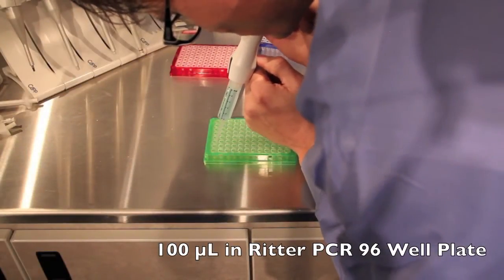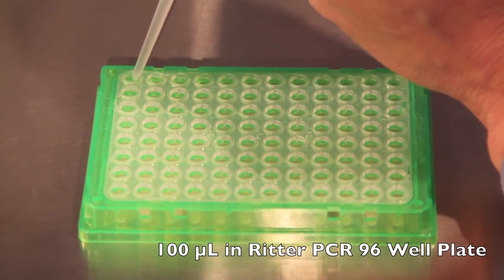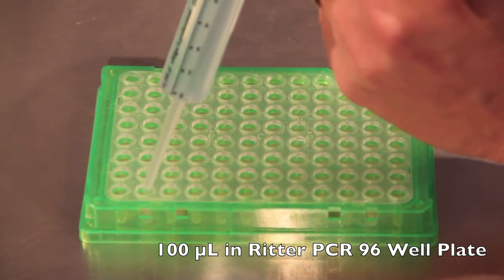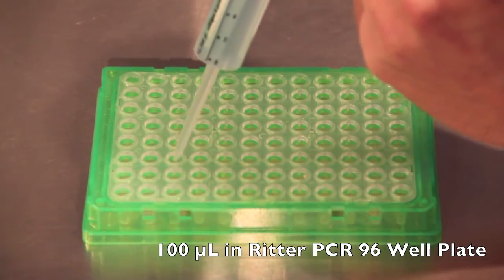Now by switching to a 10 mil syringe, the unit has enough volume and enough resolution to dispense 100 microliters into each well of a 96-well PCR plate.